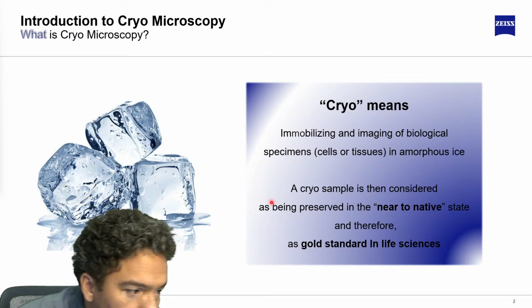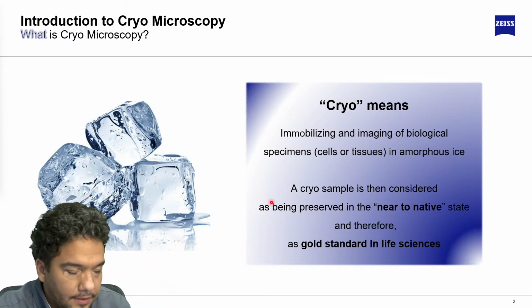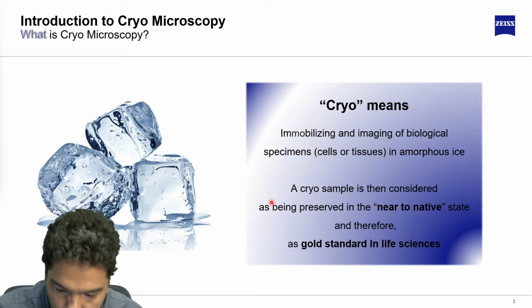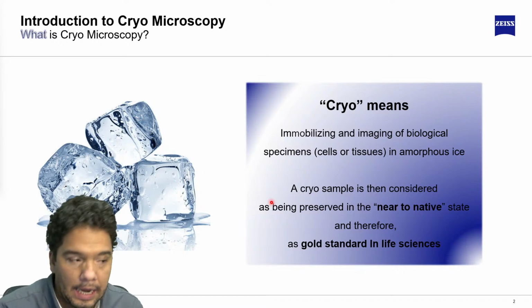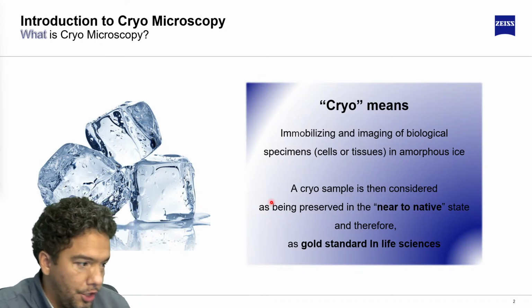This is a technique for immobilizing and imaging biological specimens. You can imagine other kinds of specimens, but today we are focused on cells or tissue.